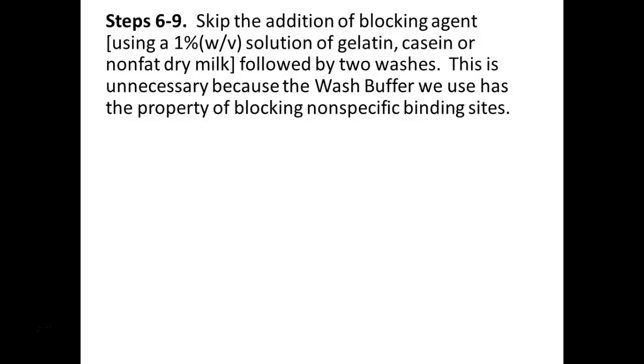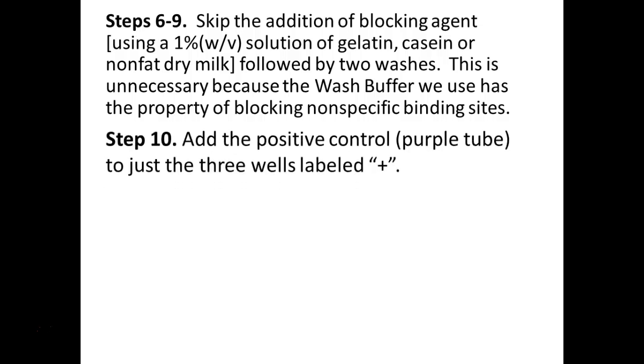So again, we're skipping the blocking agent, because some of the components in our wash buffer, and it's buffered so it's balanced for saline. It is a wash, so it's going to bubble. It's got a detergent in it, so we, again, want to make sure we get all the bubbles out before we add our next reagents.